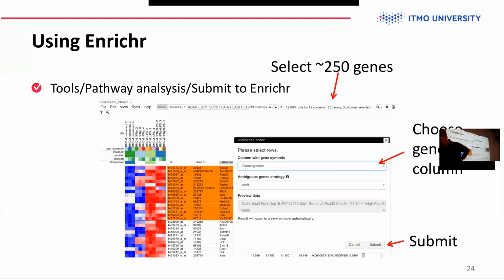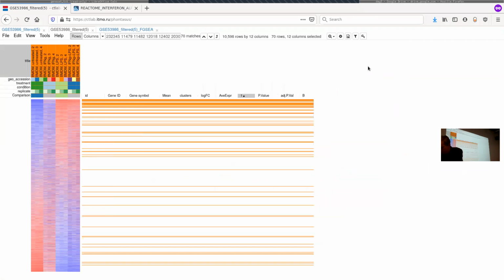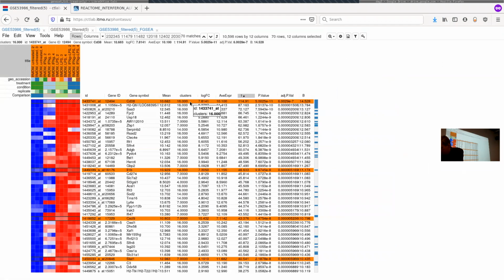Yeah, and the last thing in this part is, let's use this Enrichr website. Enrichr is a website, in some sense similar to MSigDB. It's for enrichment analysis, you can guess from the name. And it does operate in a similar manner.